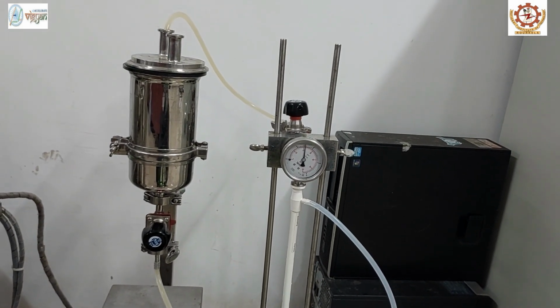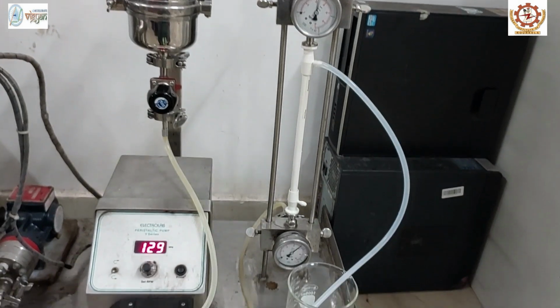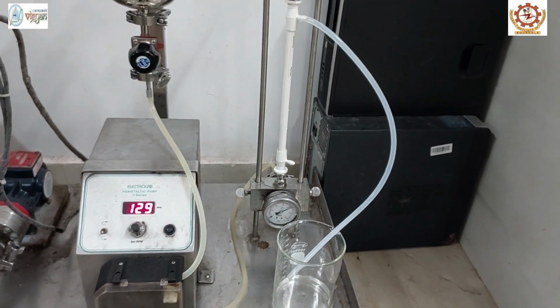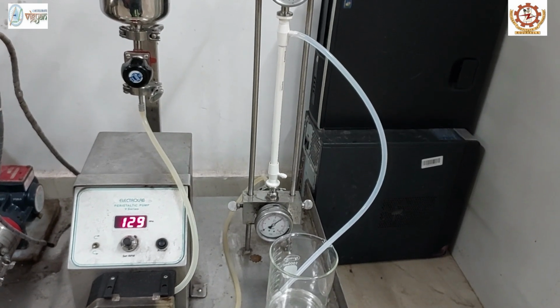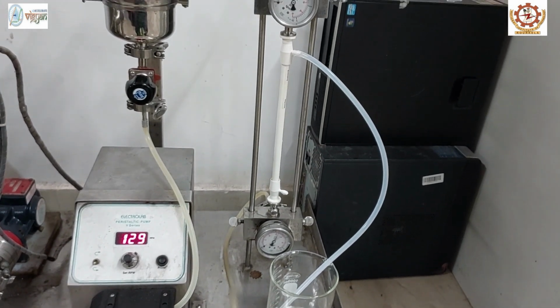For restoring the flux and to improve the cleaning efficiency, a chemical cleaning technique or acid alkali wash is usually followed along with backward flushing.